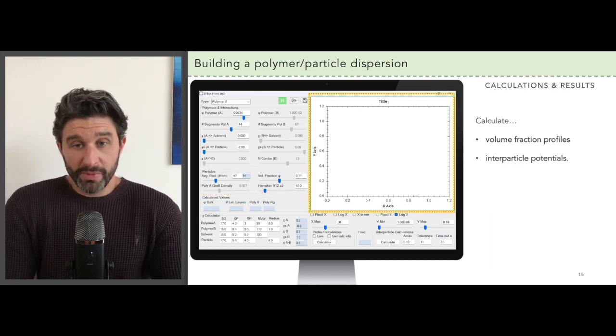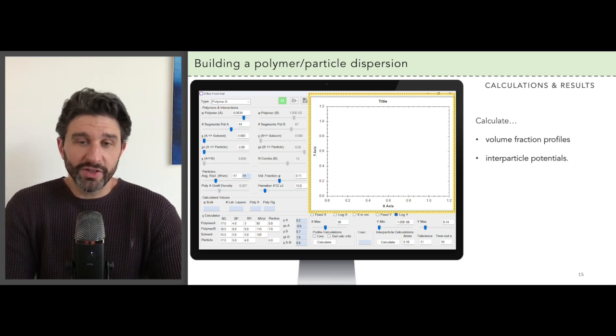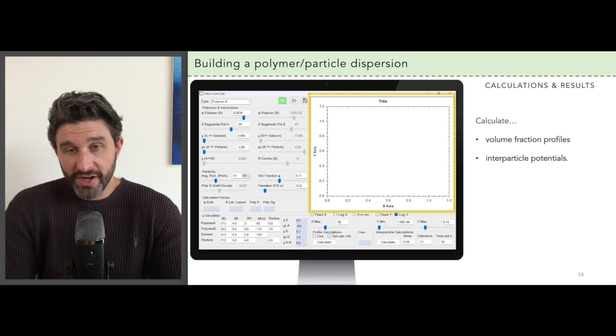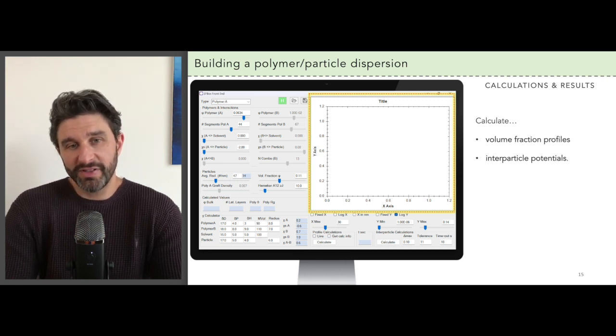We've now set up the formulation and can move on to doing calculations and looking at the results. There are two options for performing calculations: you have the volume fraction profiles and the interparticle potentials.